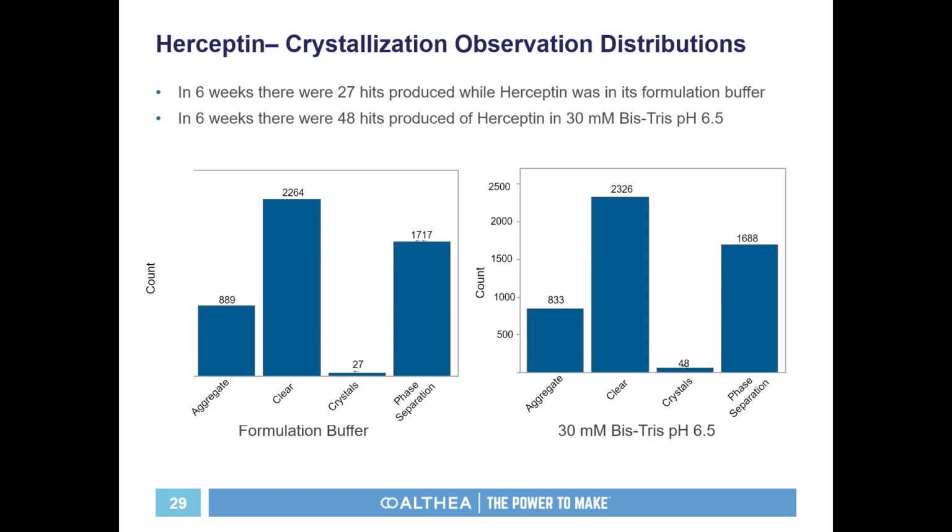This is significant for us, especially when we're talking about scaling up or selecting crystal hits in specific crystallization conditions that will help us in the long run, especially developing our formulation buffers and that crystallization suspension that is ready to be a drug product.